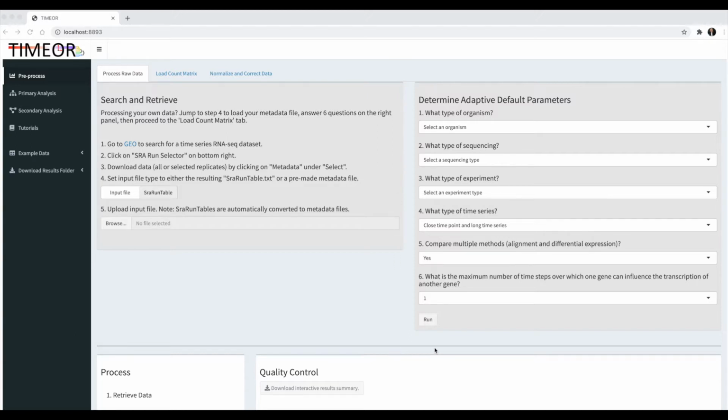During each analysis phase, TIMEOR takes the raw sequenced reads through FASTQ files that you can extract through GEO and performs all analysis from quality control to differential expression and enrichment, and then TIMEOR integrates motif and ChIP-seq data to define transcription factor binding patterns and reconstructs a transcription factor gene regulatory network.